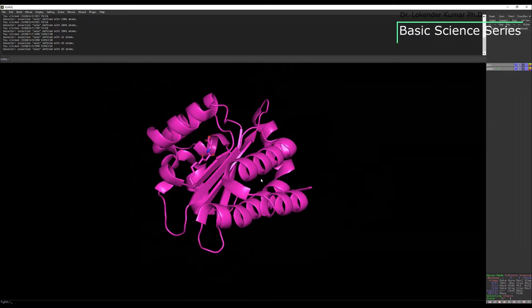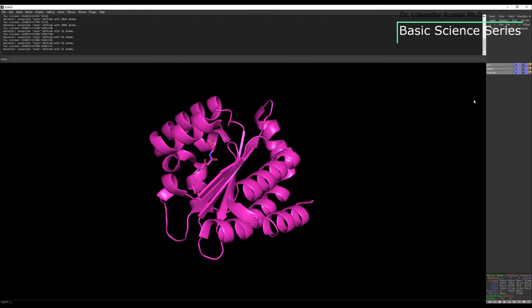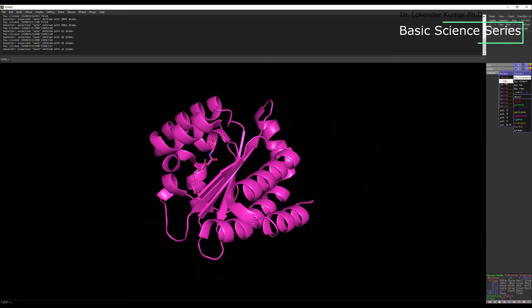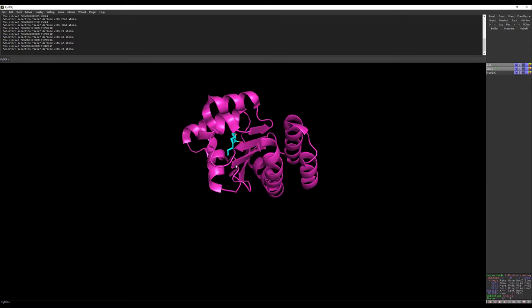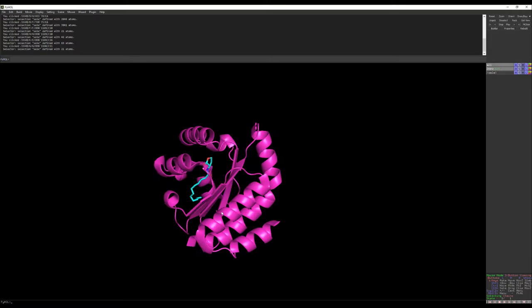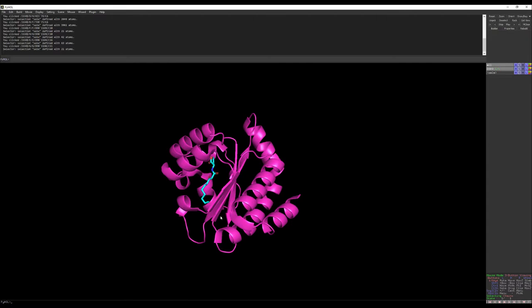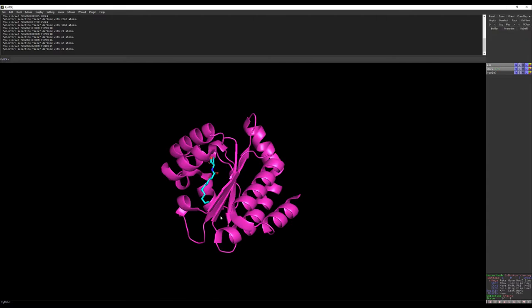To highlight the ligand molecule, I want to change its color. Select the ligand molecule, go to color by elements, and select any color you want. I'm using cyan for the carbon backbone, so you can now clearly see the ligand molecule. The protein is represented as a cartoon. You can see the ligand is in the binding pocket, close to the center of the protein.